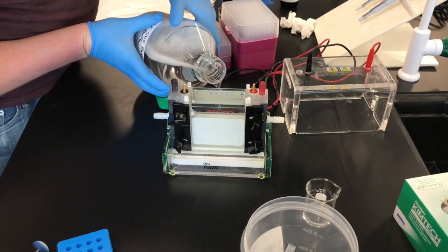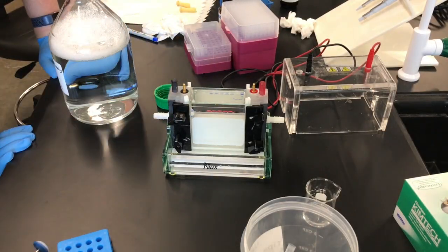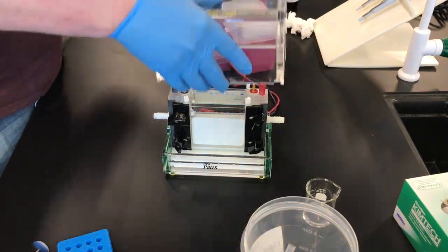Once you have loaded the samples, you can place the 1X buffer in the bottom chamber. Then, you can place the lid on, making sure that the red wires connect to the red terminals and the black wires to the black terminals.